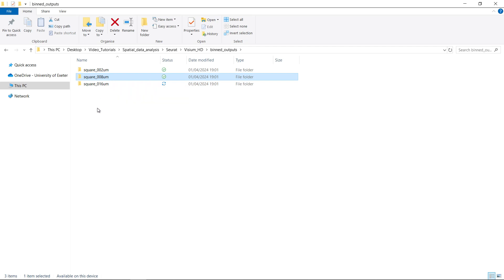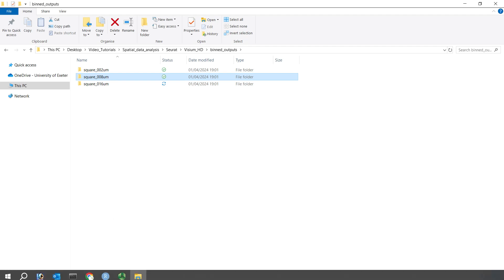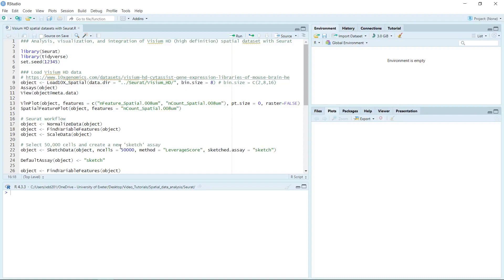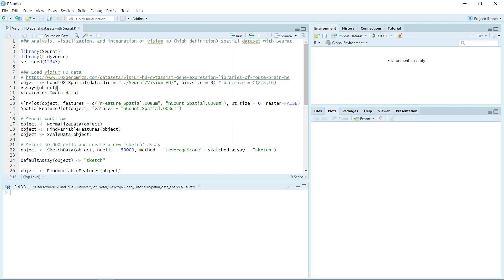Now we have the data and we are going to load the 8 micrometers data into R. We can analyze the data using the Seurat package. We will use the Load10X_Spatial function in the Seurat package. If you want to load all the data, you can set the bin size argument to 8 and 16 to load all data into the object. For today's demonstration, I'm going to load the 8 micrometers data and set the bin size equal to 8.